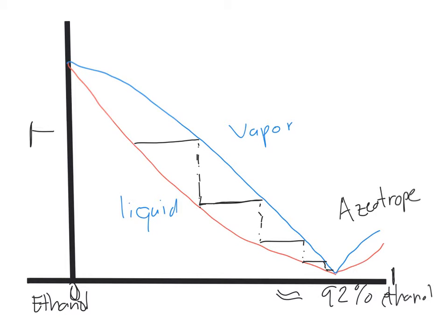So the liquid boils at this temperature and then turns into vapor, which has a higher concentration of purity, and condenses once again, boils at this temperature, and vaporizes once again. At each step that it condenses and then vaporizes, it becomes more and more pure until it gets to 92% ethanol, which will then be the most pure it can be because an azeotrope was reached.